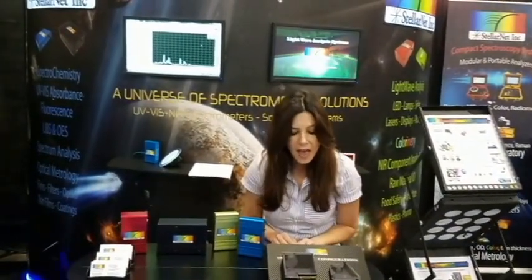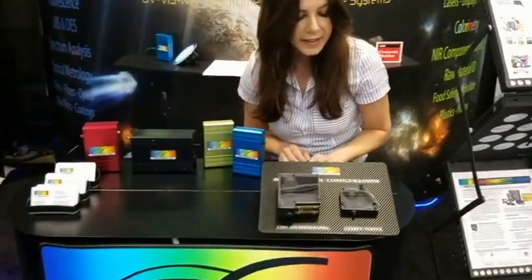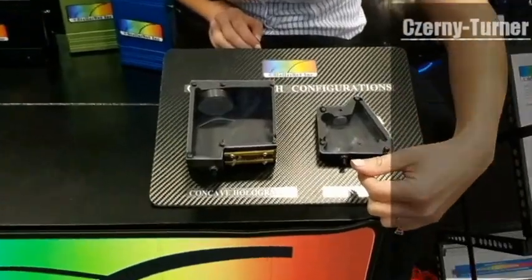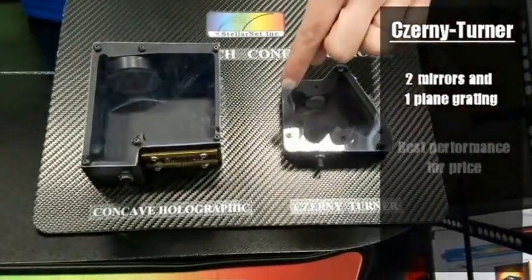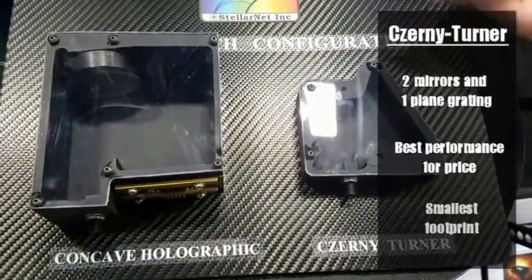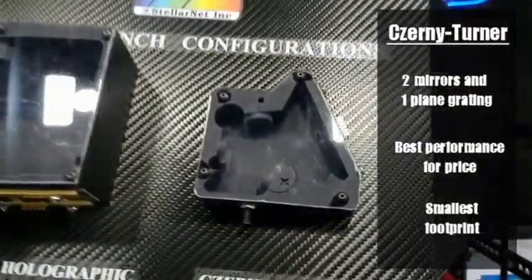You see the internal optics bench design. Right here is our crossed Czerny-Turner design. As you can see, light enters through this entrance aperture. It hits a mirror, which then reaches the grating, where it then hits another mirror, and then it reaches a linear detector array of 2048 pixels.